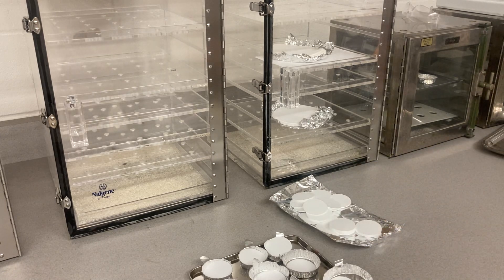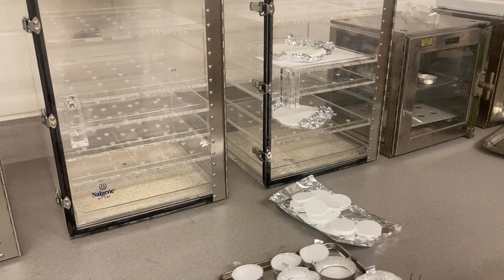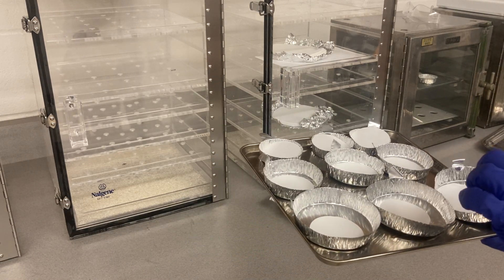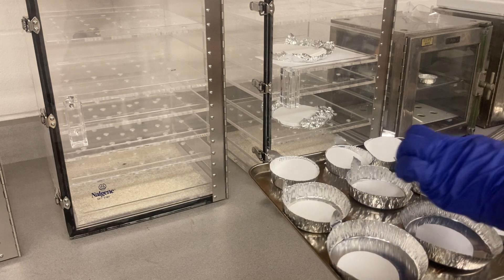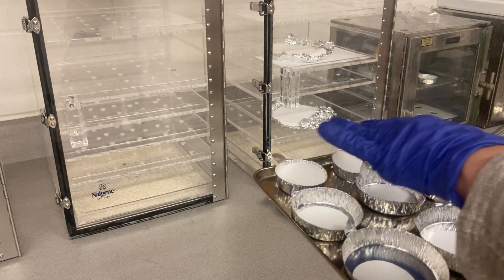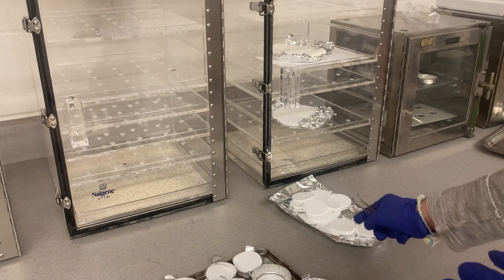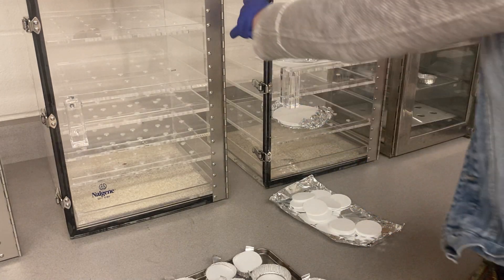Now we have nine of them. This one is going to be my run-off sample, this one is going to be my activities last sample, and on the top row it's going to be just a plain sample. I put everything back into the desiccator.